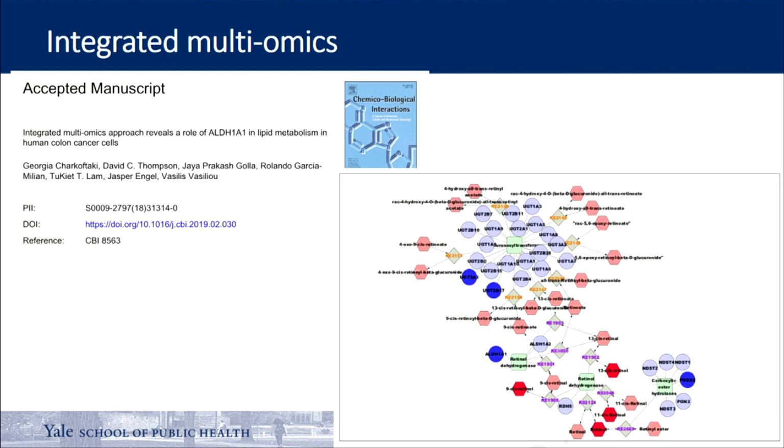The data were very encouraging, and we showed quite a few very distinct pathways as a result of the combination of the 3 omics used in this case. I thought it was really important. Is it good enough? Is it very effective? It took us a long time. No, it's not. So we need to move on to a different kind of platform.